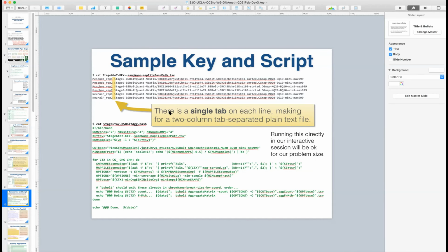Sean, just a quick question. Yeah. So with this bug, presumably then it would be a systematic error. If you were processing all your samples, then all of them will have an underestimation because, as you say, there's the rounding down issue. But it's never good when you think you asked for at least 5 samples present, and then your output files have some with only 4, right?